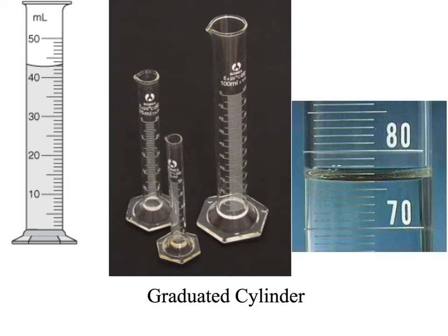I'd estimate one decimal place, so that'd be 43.0. Over here you can see the 70 and 80 lines — 75 is right there — so I'd call that 76.1 milliliters. That's the function of the graduated cylinder.